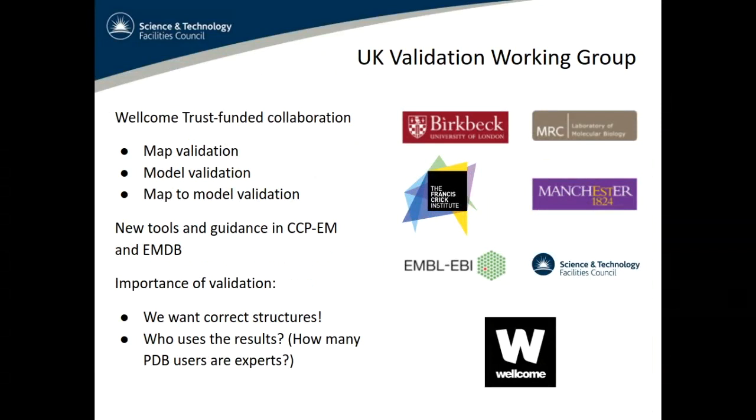Just highlight the importance of validation. This is making sure that our structures are correct. It's easy to deceive ourselves when we have a nice map and we want the model to fit. We obviously want to be correct, and we don't want to end up being cautionary examples used later when we've got something wrong.